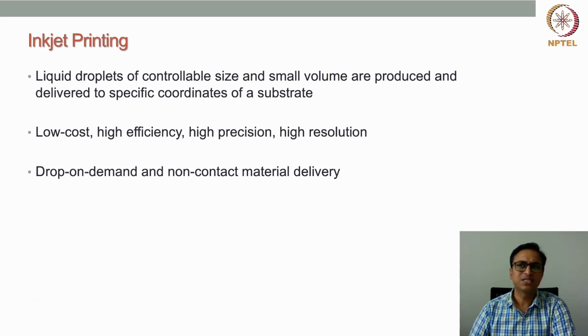And this is a low cost technology because most of you have seen that printers are not very expensive. Most inkjet 3D bioprinting is actually done by modifying office printers to suit printing biomaterials, cells, and pharmaceutical components, right?